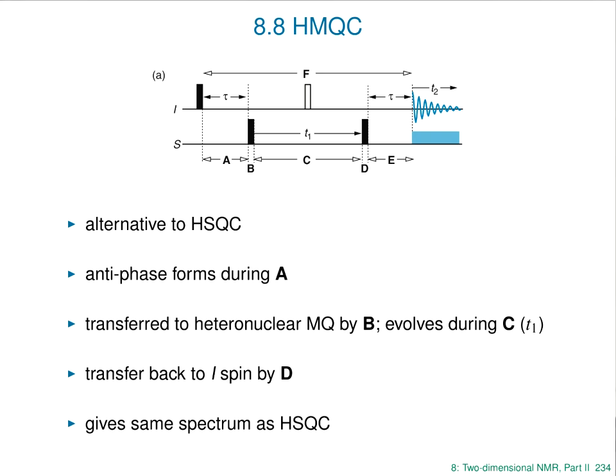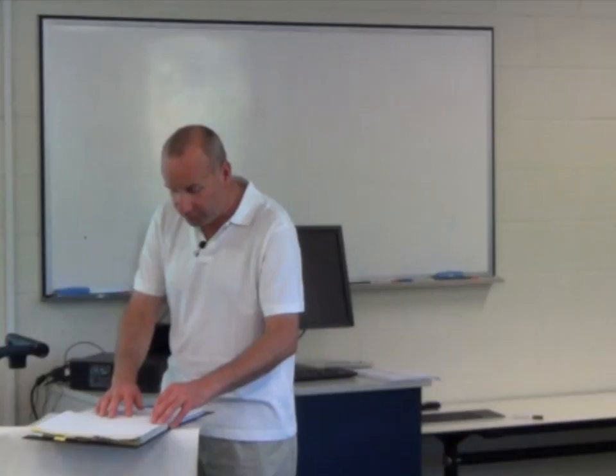And although it looks very different, the spectrum you get is exactly the same as the one that we got from HSQC, but it arises in a rather different way.